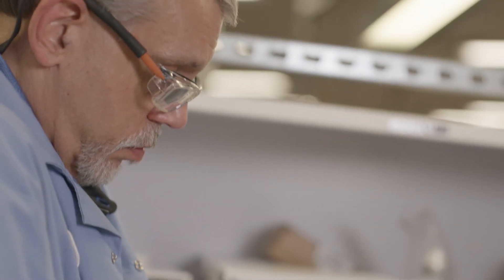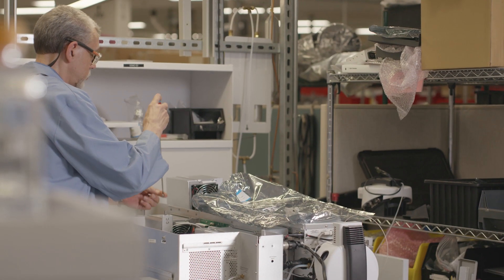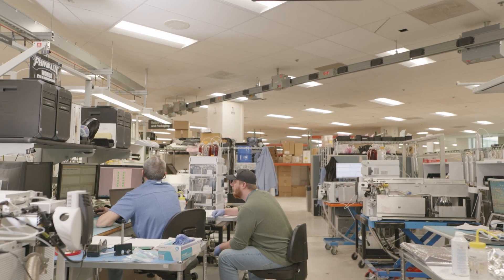When the instrument comes in we do a brief look over of it, replace anything that may be missing. We do an individual test through tuning and diagnostics just to see what the condition of the instrument is before we work on it.